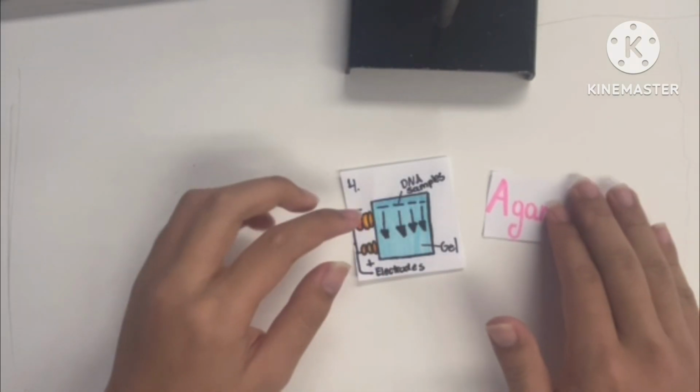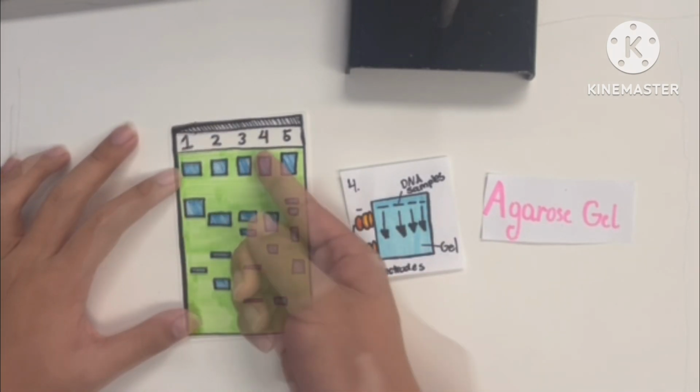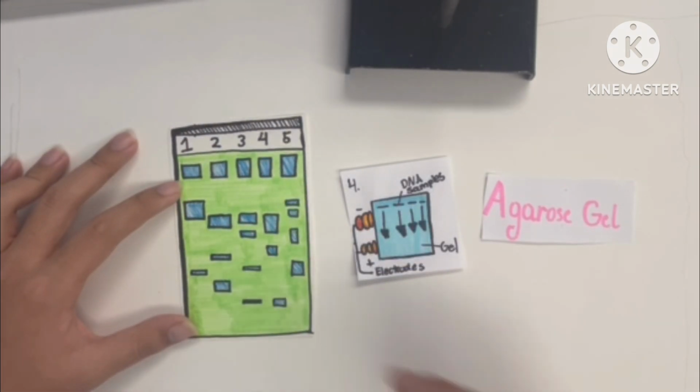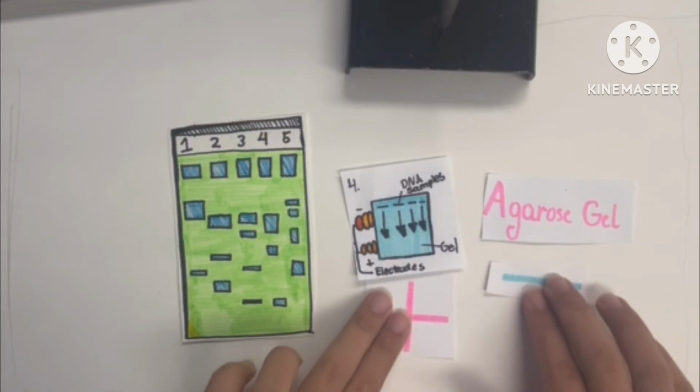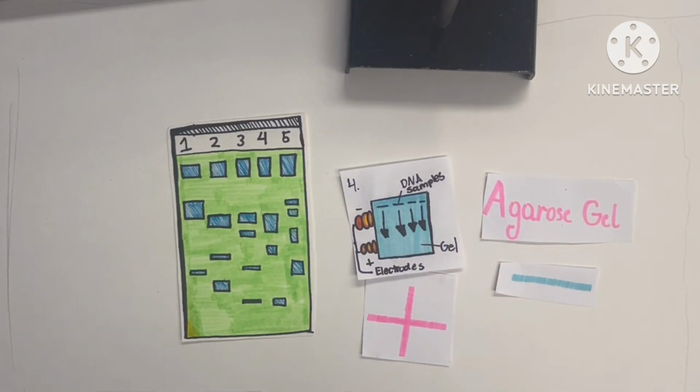Gel electrophoresis starts with preparing an agarose gel. This is poured into a tray and wells are formed, later used for the DNA strands. Then the ends of the tray will be charged with a positive or negative charge. A type of dye along with the DNA strands are put into the wells.